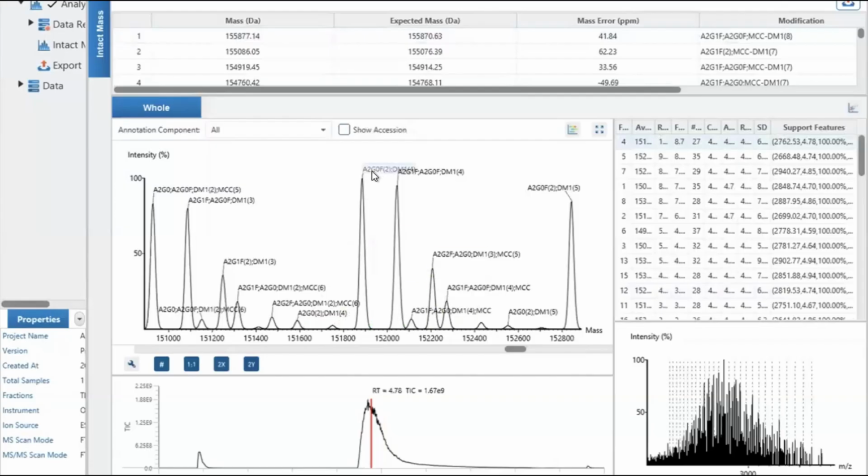Okay. Here we just modified those annotations. And for each annotation text, you can use your mouse to drag this tag and put it somewhere perfect.